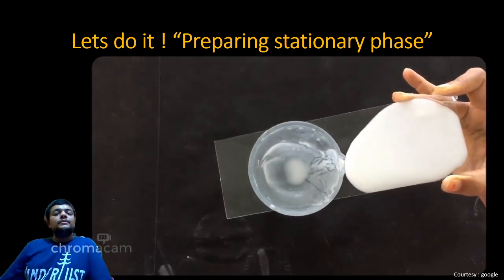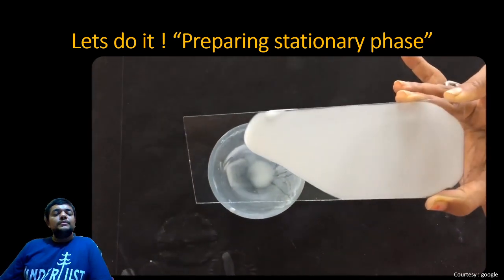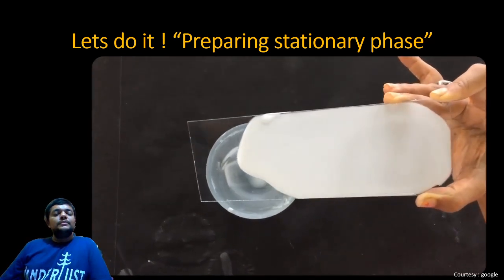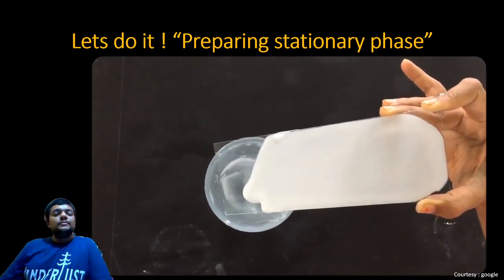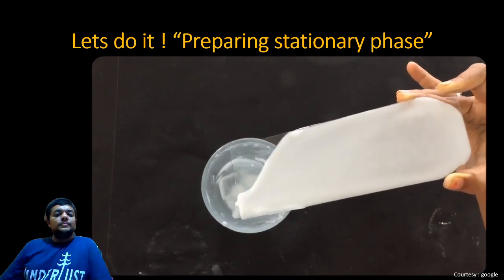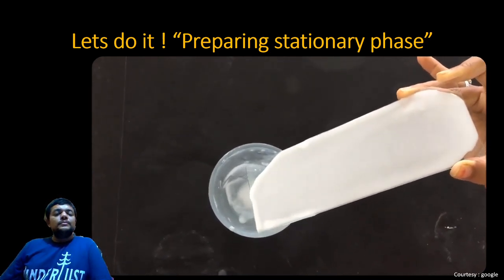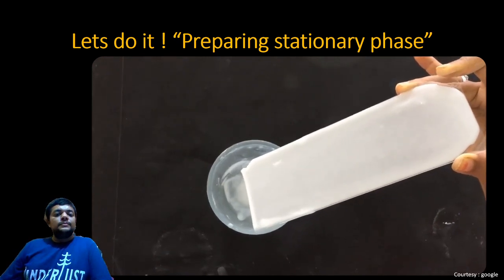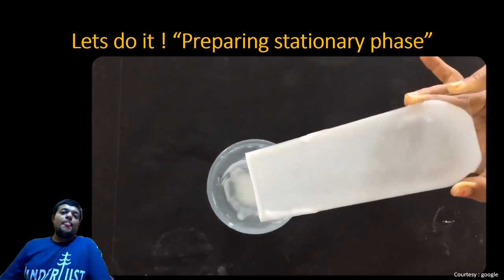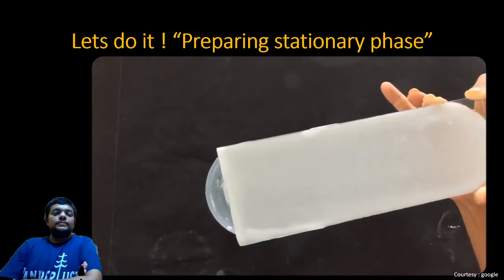These TLC plates can be used for analytical study. It is used to identify the components of a mixture and also to check the purity of the sample. Move the glass plate so that the slurry gets uniformly coated over the glass plate. You can see that the slurry is uniformly coated over the glass plate. After uniformly coating the slurry, dry these plates at room temperature.